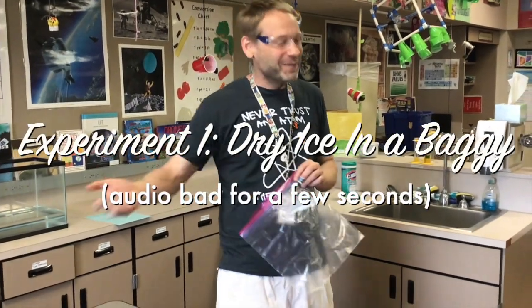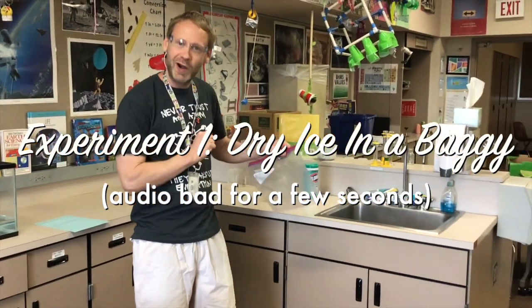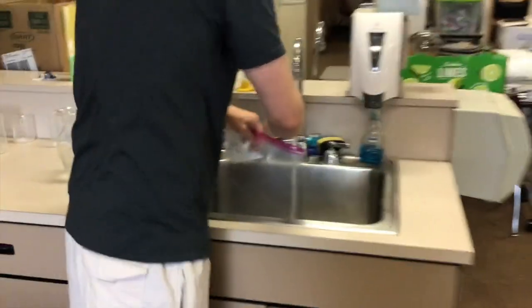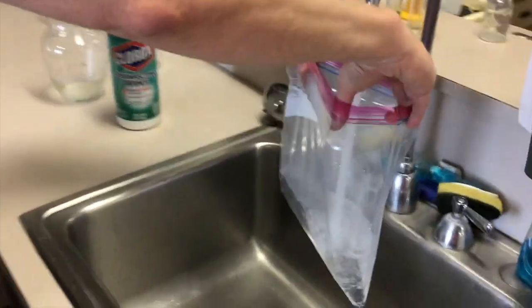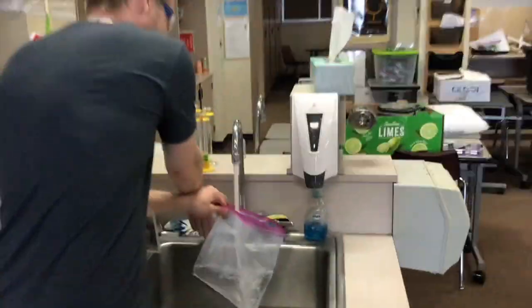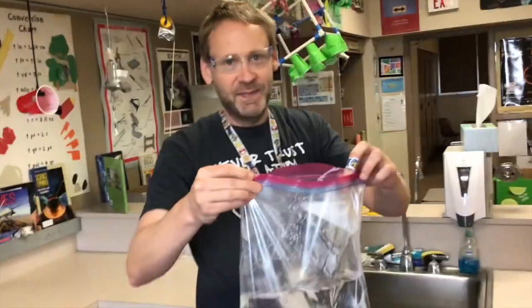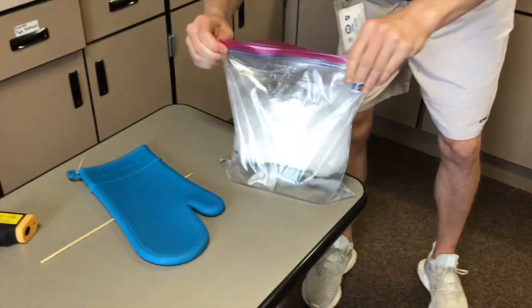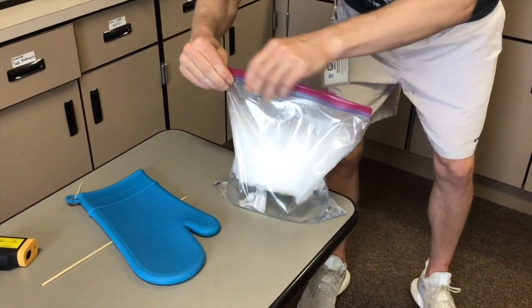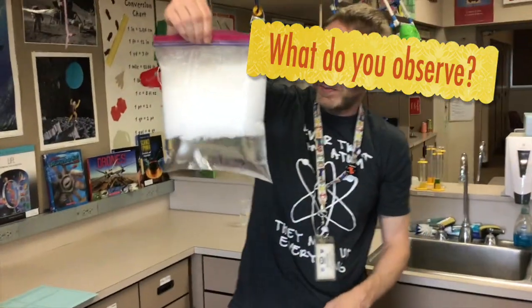Let's kick things off with our first experiment — dry ice in a baggy. I'm going to put some water into our baggy. Mr. Fritz is going to get a chunk of dry ice. I'm basically putting some warm water into a baggy right now. I'm going to close that off. I always want to say our baggy helps if you get a double seal on the top, because some pretty cool things are going to happen. Mr. Fritz is going to drop in a chunk of dry ice. I'm going to seal this quick. There we go. Nice and sealed. No gases are getting in or out, no liquids are getting in or out.